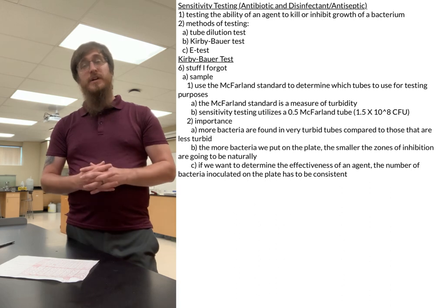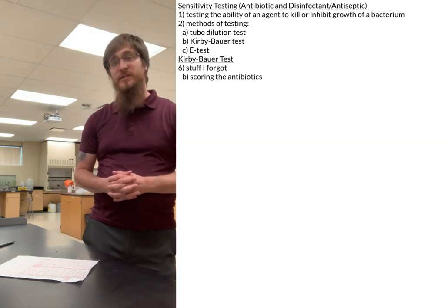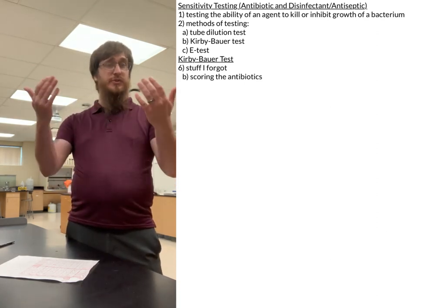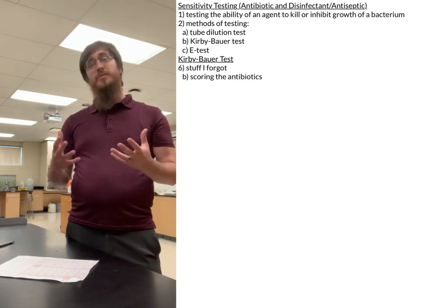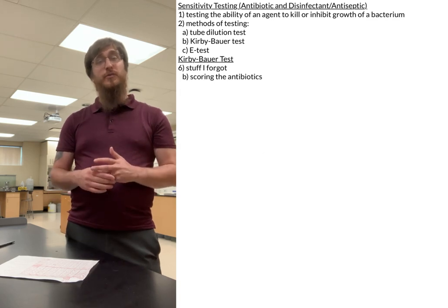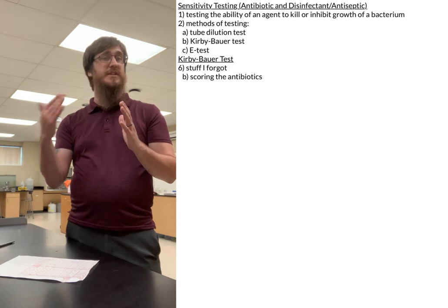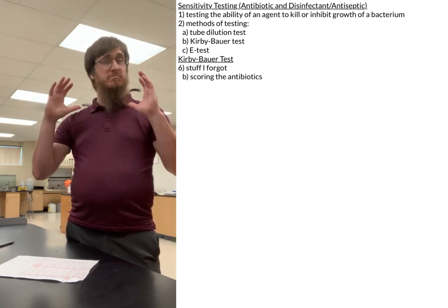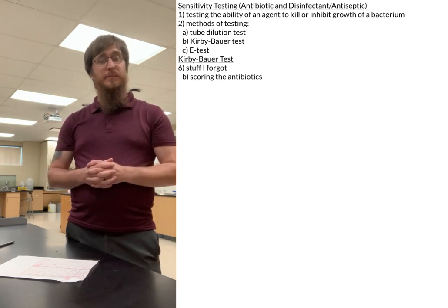The other thing that I forgot to mention was in the scoring part of this, when we were looking at the antibiotics and the way that we score them. So in the video, I just go through and directly score them based on their zone of inhibition numbers, and that was a little bit different from the way that we scored the bacteria. With the bacteria, we first gave them that arbitrary score based off of their resistances, intermediates, and susceptibility, and then we looked at the numbers. So let's go ahead and talk about doing that part with the antibiotics as well.